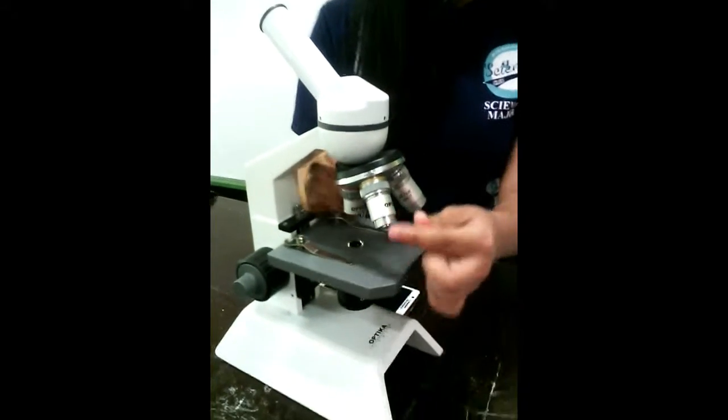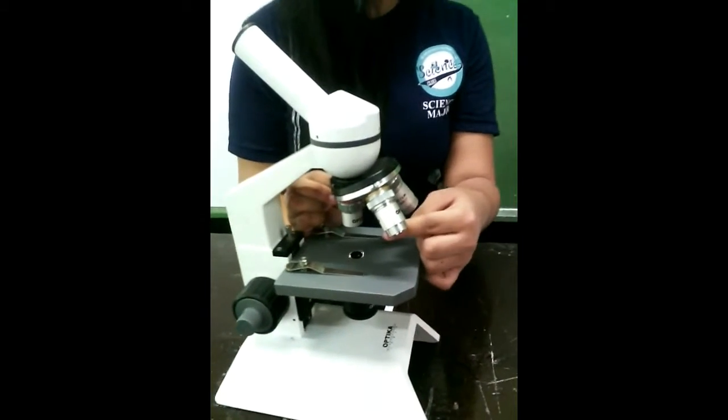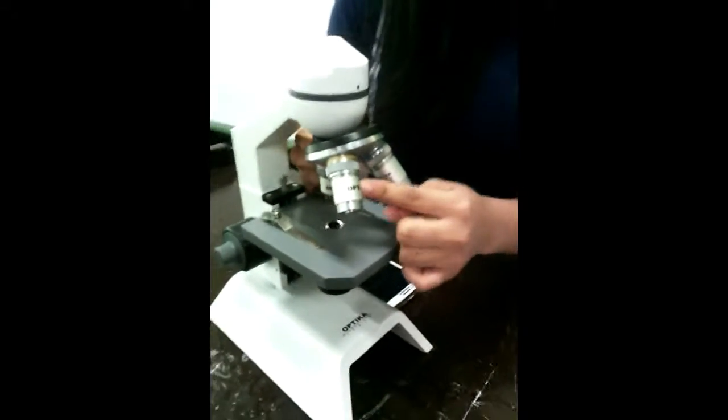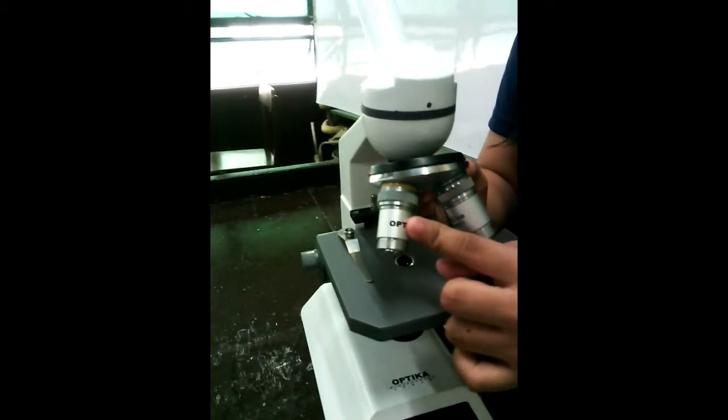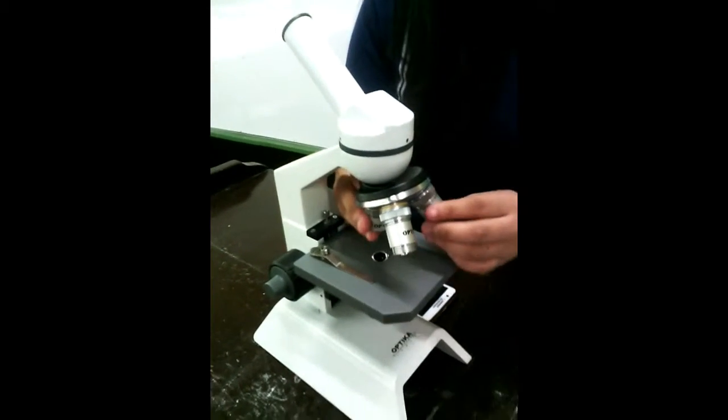The low power objective is a shorter cylinder with a large lens opening. It is used to observe the general outline and locate the various parts of the specimen. It is focused using the coarse adjustment knob.